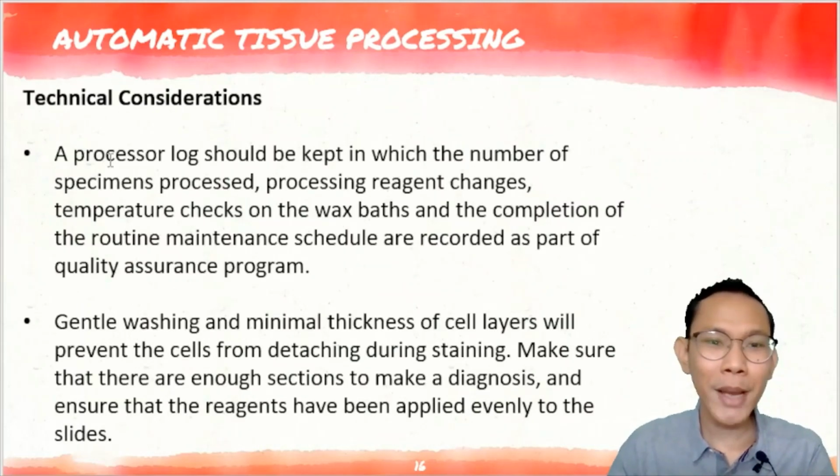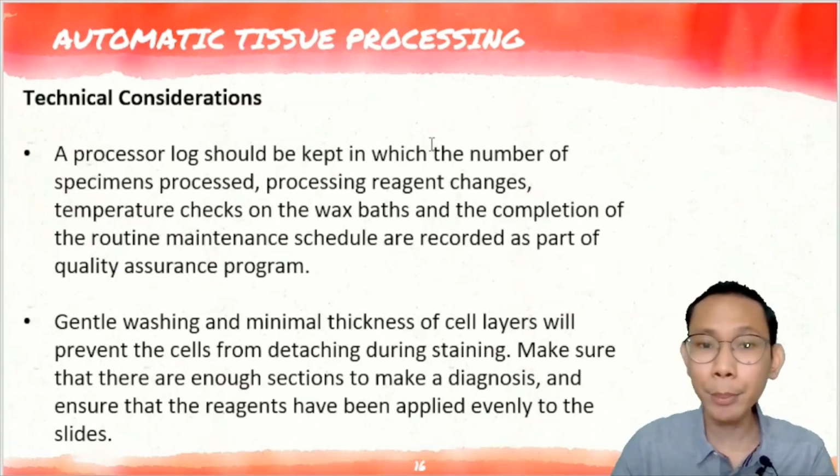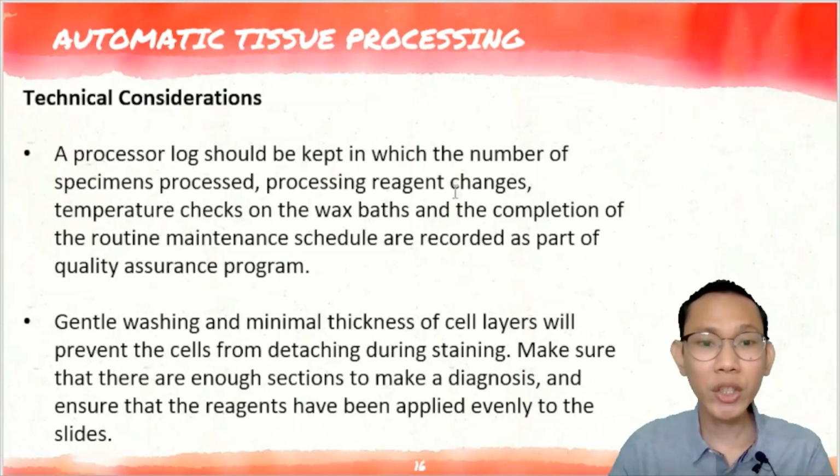Again, ito naman, a processor log should be kept in which the number of your specimen processing, reagent changes, temperature checks of the wax bath, and completion of your routine maintenance schedule are recorded as part of your quality assurance program. So we just want to have a proper documentation.